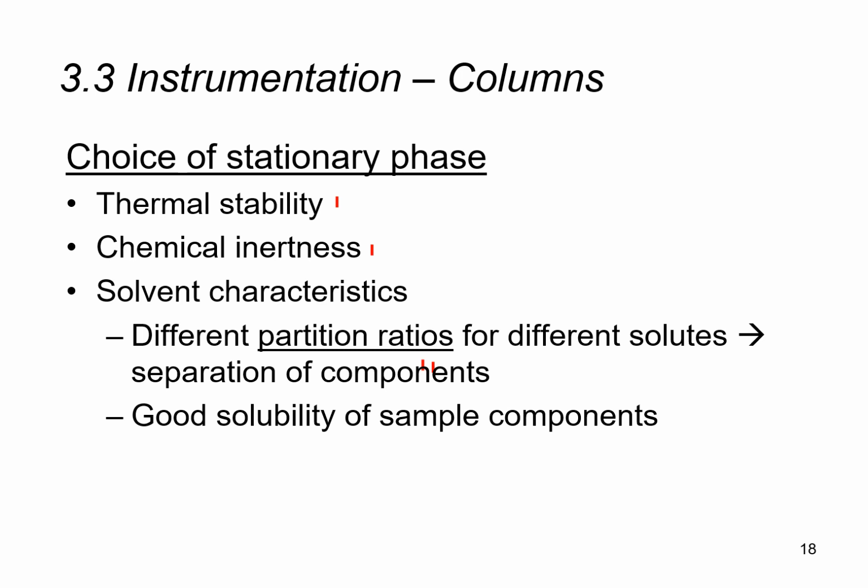And of course, that extent of interaction is very dependent, as earlier mentioned, on the solubility of these various components. The more soluble these components are, the more they'll interact with the stationary phase. The less soluble these components are, the less they'll interact with the stationary phase. And of course, this parameter is what allows us to separate the various components for detection.